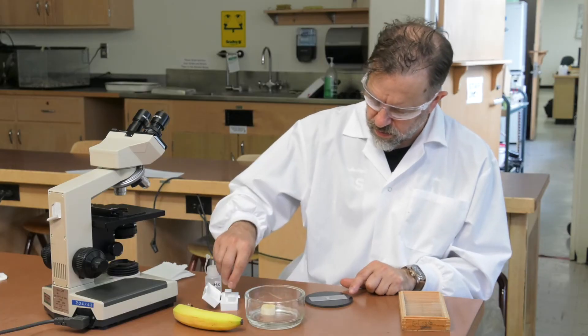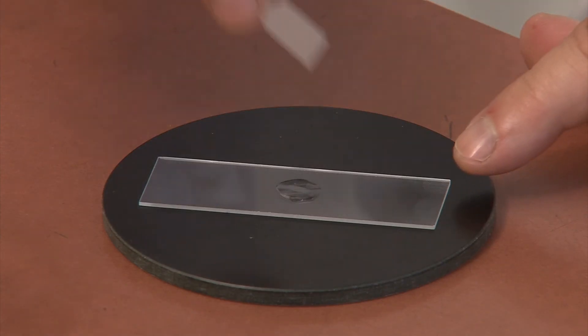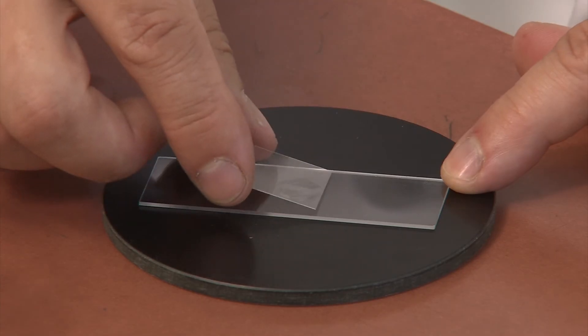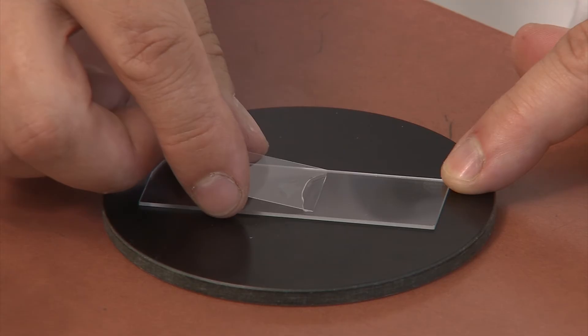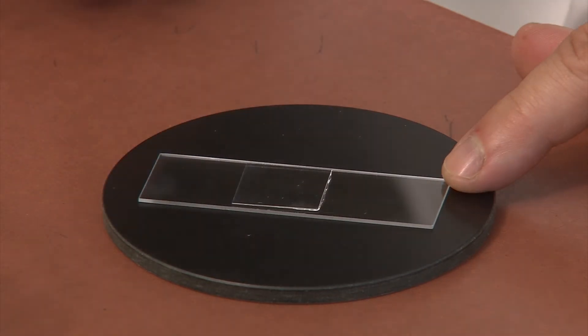Carefully apply a cover slip. Scan your slide under the four times objective. You should not have large masses of banana tissue. Since these cells are transparent, you will need to close the iris diaphragm by moving the adjustment lever to the right.